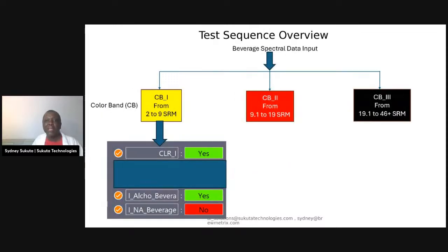So when we run the samples, the first thing we do is determine the color band, as I explained already. It's going to be either of these. The ones I'm going to show you are in this category, the more pale, yellow, orange looking. You're going to see it say CLR1, as you see here, which means color 1. Then we check. I'm going to show an example where we want to check if a beer is non-alcoholic or has alcohol in it.